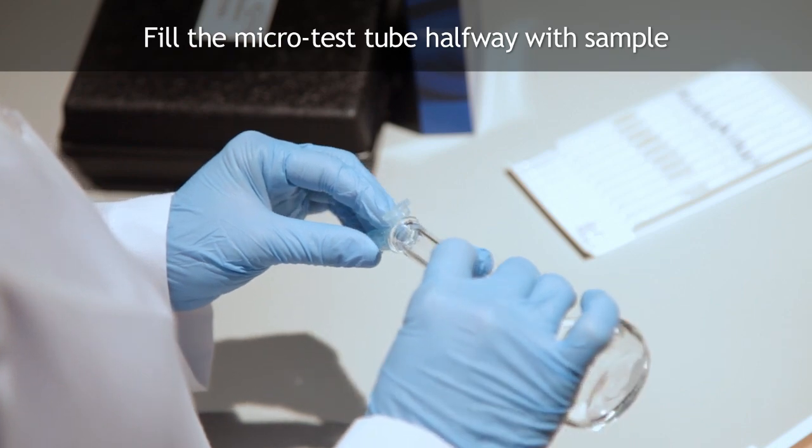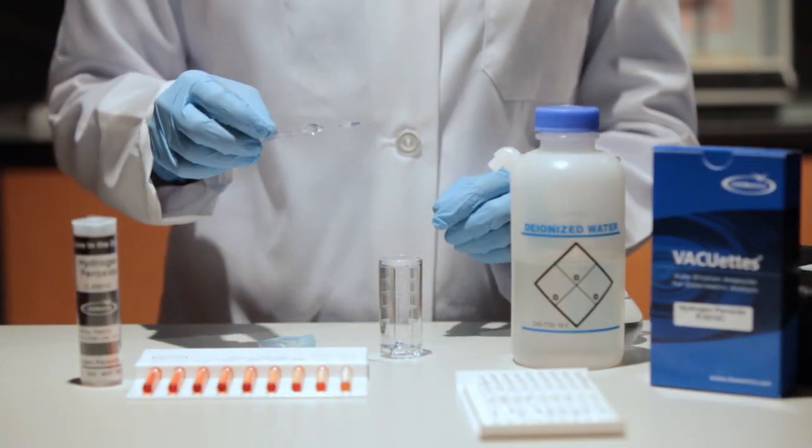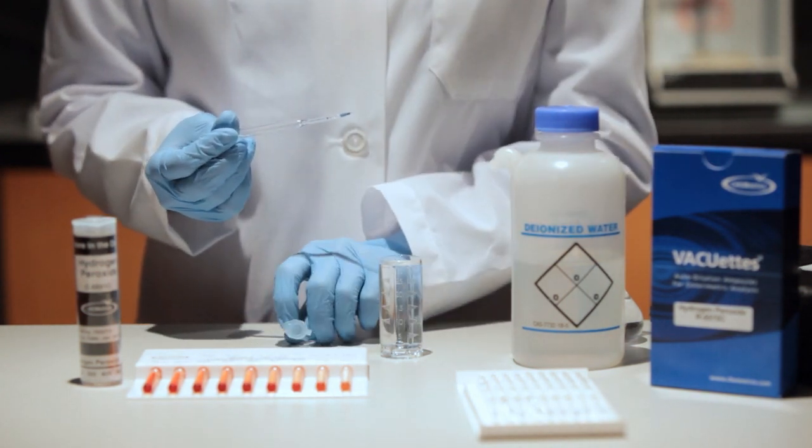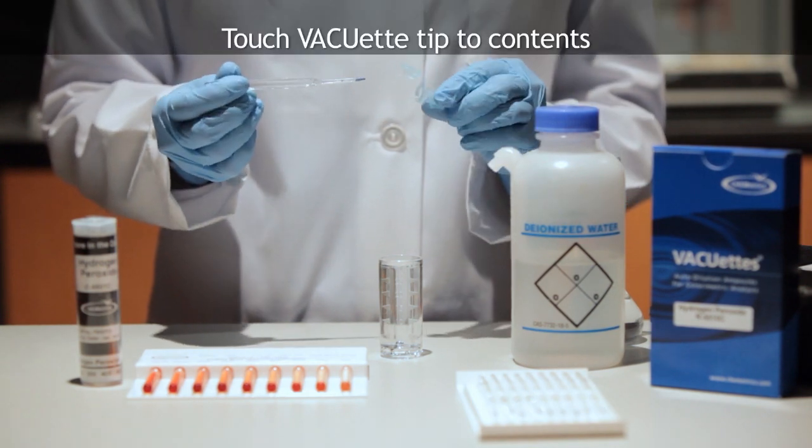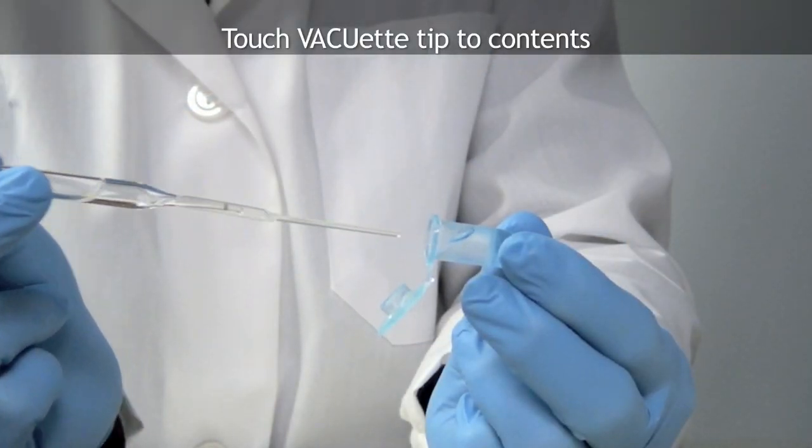Fill the microtest tube approximately halfway with the sample to be tested. Making sure that the VACUETS tip is firmly attached to the ampule tip, hold the ampule in a horizontal position and touch the tip to the contents of the microtest tube. The capillary tip will fill completely with sample.